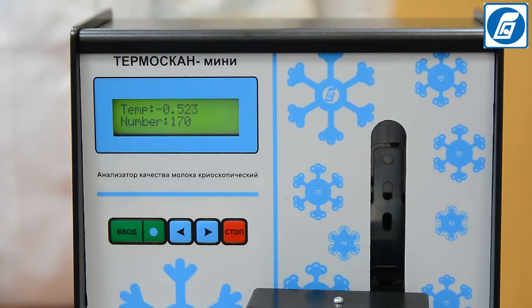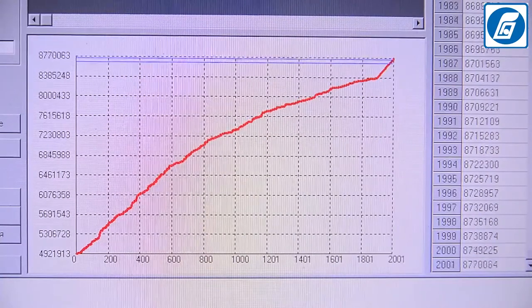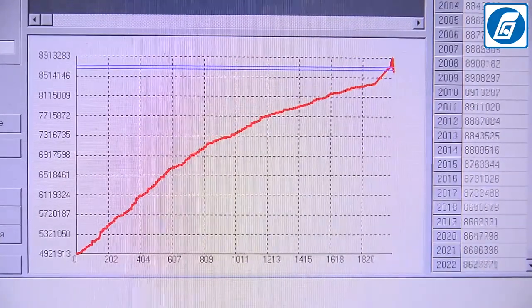Temascan Mini Cryoscope has the option for saving measurement data in the analyzer's memory, transferring them to a personal computer for saving and processing in a special program, and printing out measurement results on a special printer.